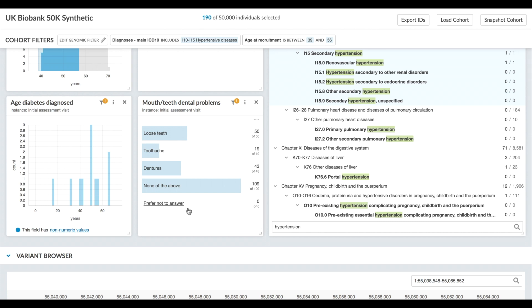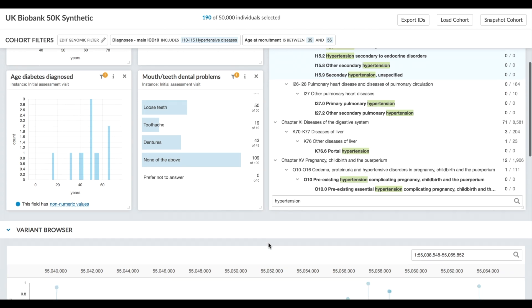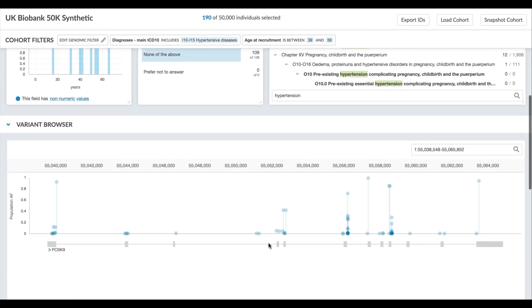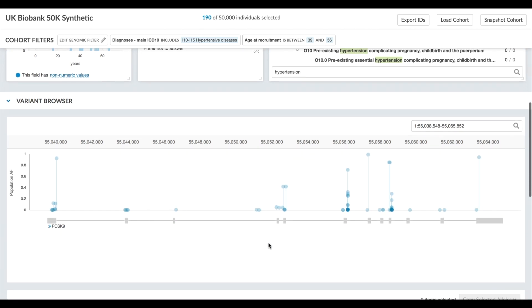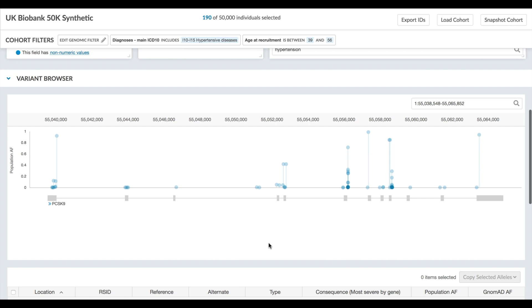From this point you can apply more filters and keep digging deeper into the phenotypic relationships, or you can take a peek at the genomic data. The variant browser shows all the variants present in this particular cohort.